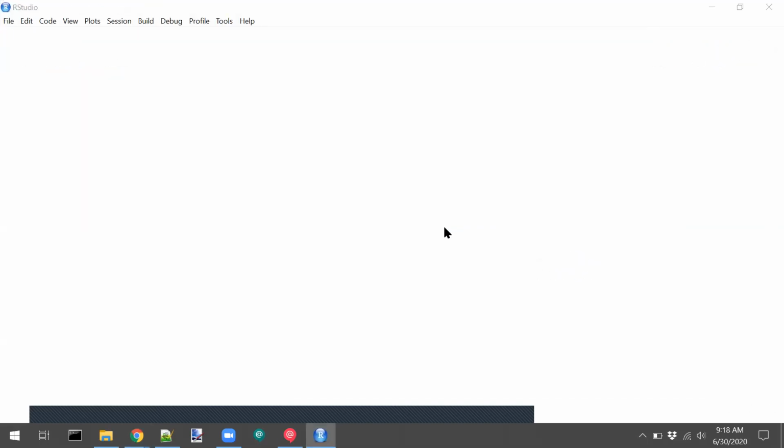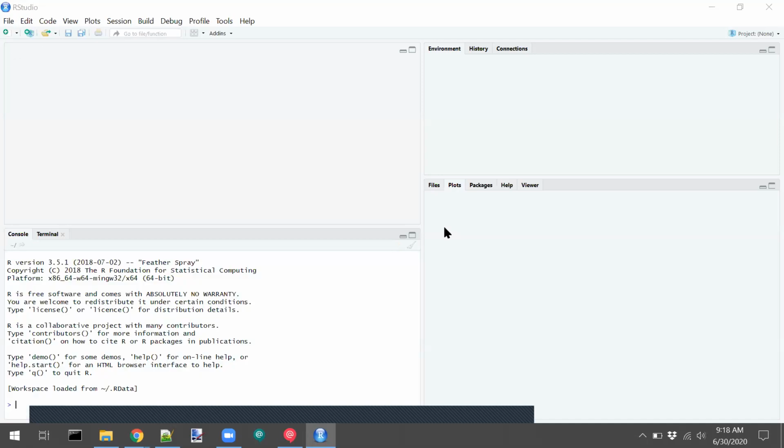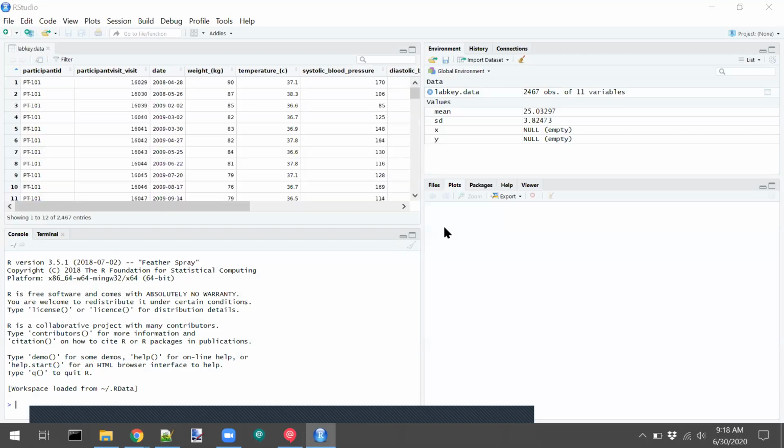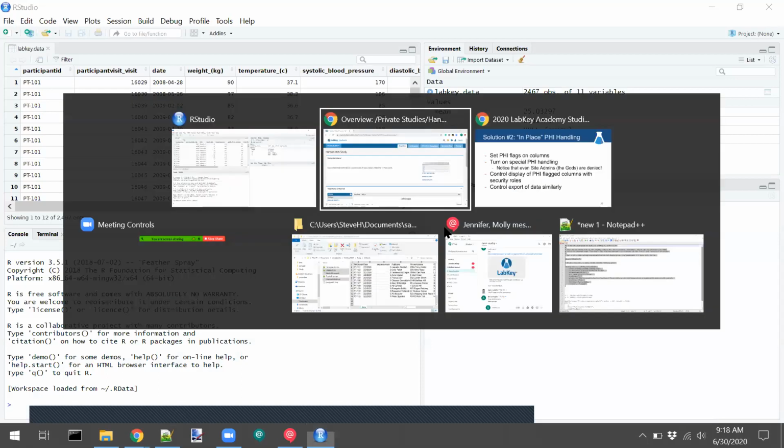And how can I point this? Because I think we've seen a lot of questions here about how far the visualization engines go in LabKey, and they're pretty good, but they're not as good as R. And so people love to work with R. It's one of the ultra powerful visualization engines. You can actually point your own R instance at a LabKey site.